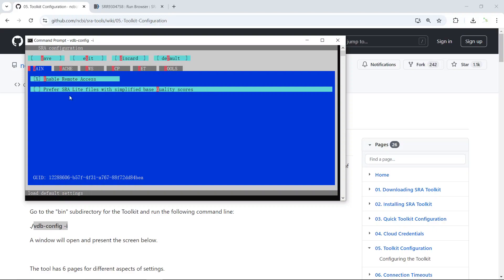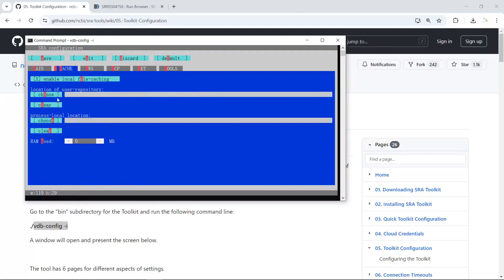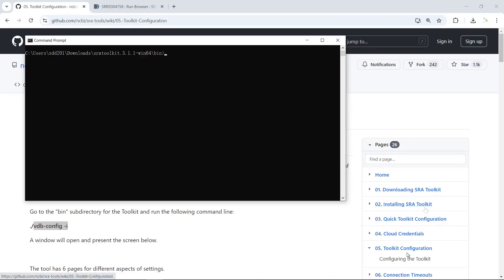The default settings enable remote access, which we need to download the raw sequencing data from NCBI. If you want to change the file's location, you can go to the Cache section. There you can change the file's location. We'll use the default settings for now. The other sections are for Amazon and Google cloud computers. We can exit back to the main screen.